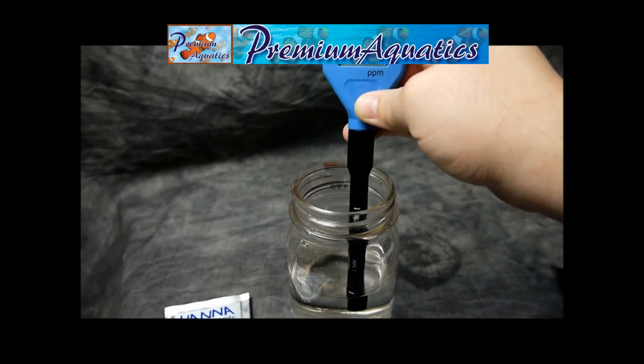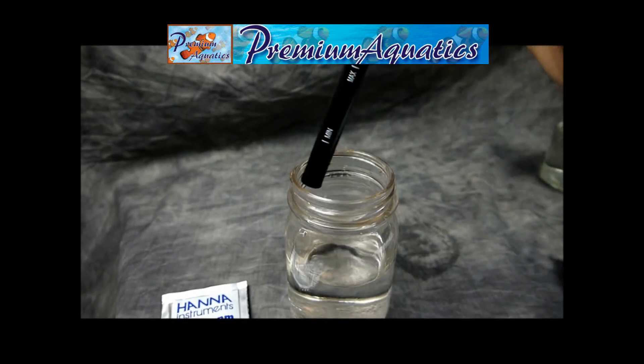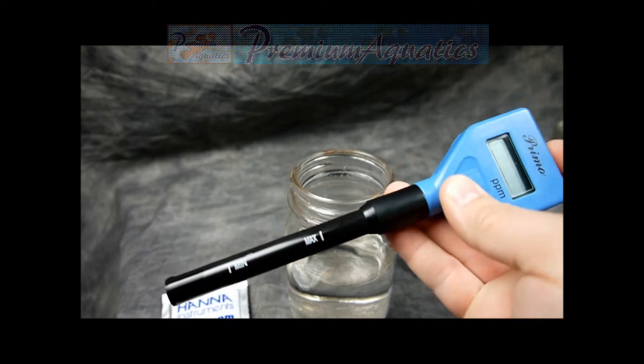And that's all there is to it. You can turn your unit off, or it'll automatically shut off after five minutes to save the battery. Dry it off, make sure it's good to go, and store it for the next use.